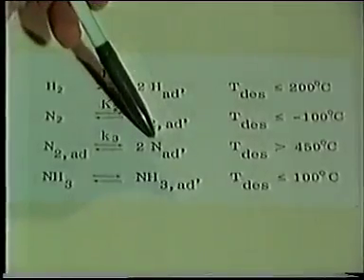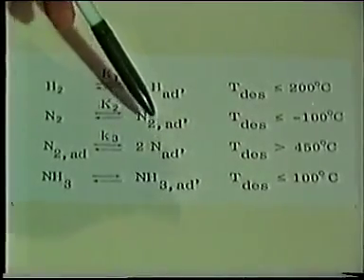So if we are working at 300 degrees centigrade, it's quite obvious that the concentration of the species we are measuring under high vacuum conditions is identical to the conditions we have established before under our steady-state reaction conditions. Yes, I see. So you measured the surface concentration of atomic nitrogen under reaction conditions. What did you find? Let's look back at our Auger spectra.